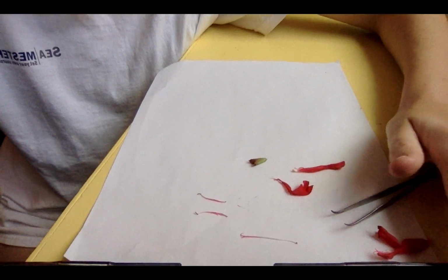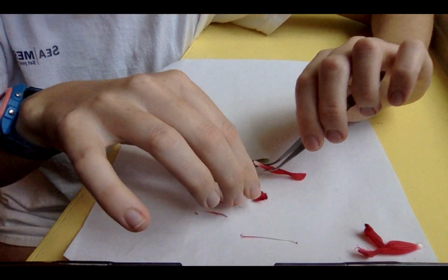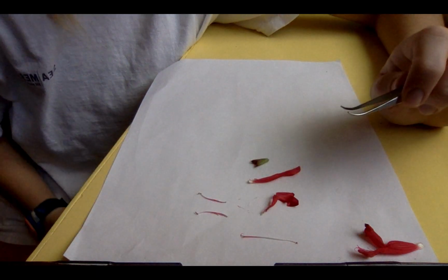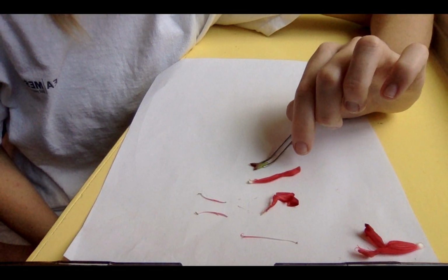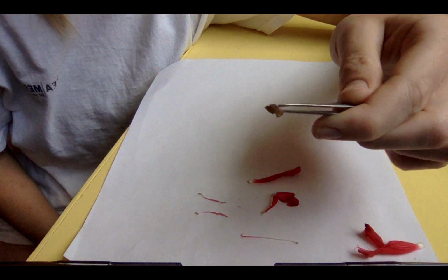And so when we take a closer look, so here's the flower, we can see it has two petals. It has a singular sepal, which actually has 3 lobes on it.